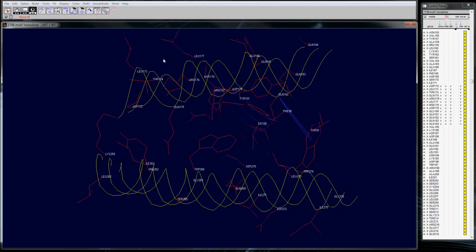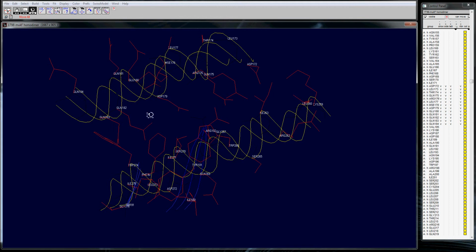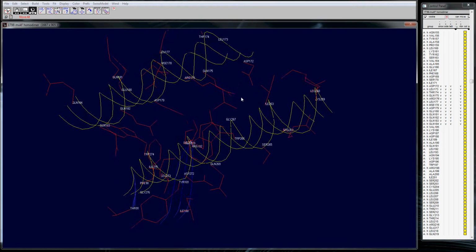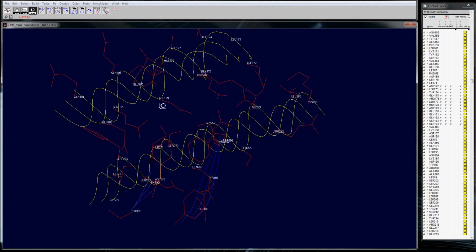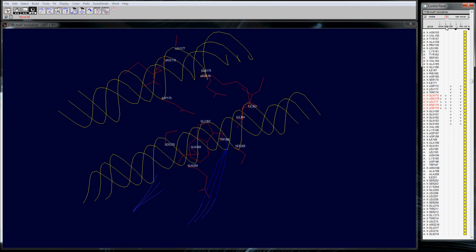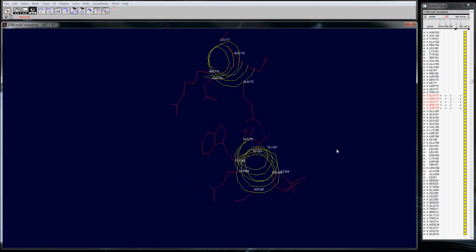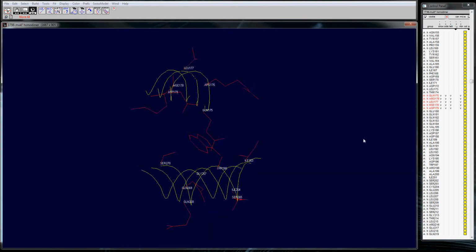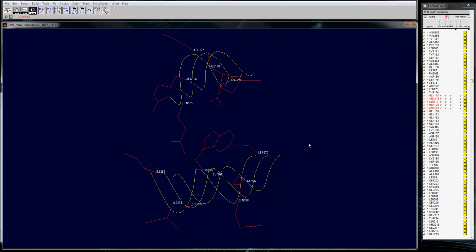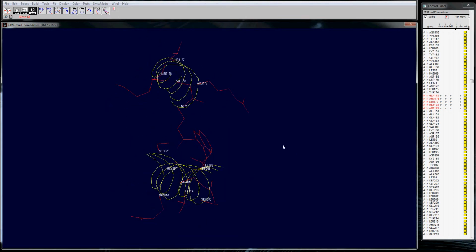What is that? Well, it's either 179 or 182 till I think 175. I can't decide to include. I'm going to go conservative. I'm going to go 179 to 175. So 175 to 179. And then I'm going to leave the blue as is, so we're going to update everything. And now we have a much simpler active site. I got rid of the blue by mistake, but oh well, we'll pretend that it's still there.